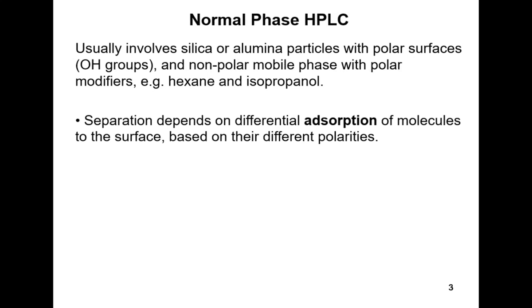So I'm going to start off with normal phase HPLC. The name comes about because it was the first technique which was developed, so it was originally the standard method. It's not used that often anymore, but there are probably still applications where it gives good results and it's worth trying out. The material's a bit cheaper than the more commonly used reverse phase HPLC.